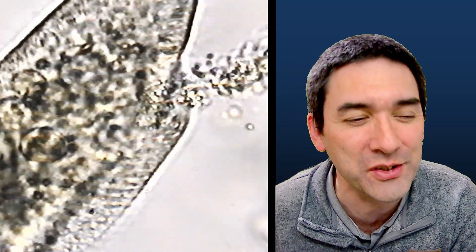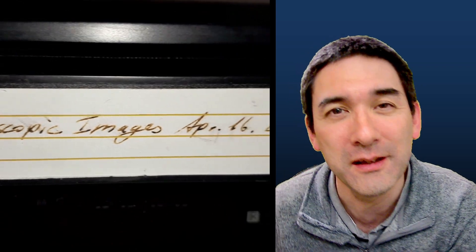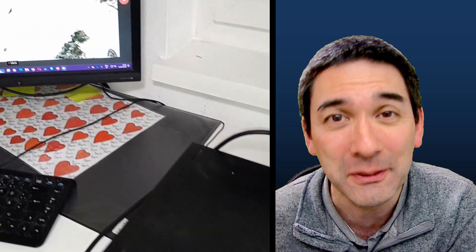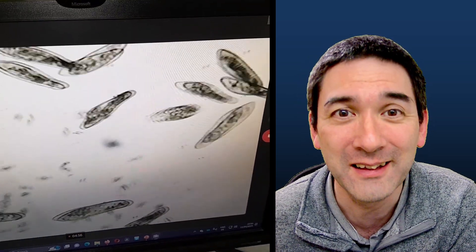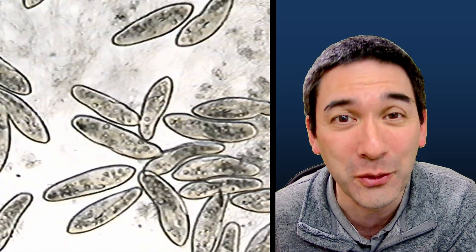They're from the year 2000 because at that time I did my first video recordings using a microscope and I taped everything. I just recently rediscovered those videotapes and was able to digitize them and now I'm able to show them to you.